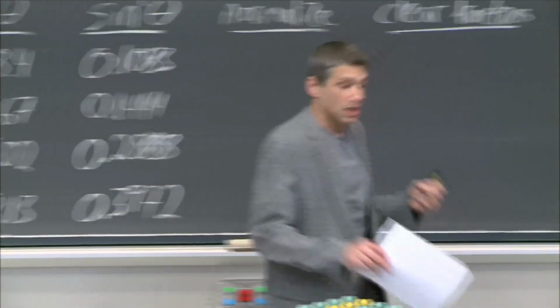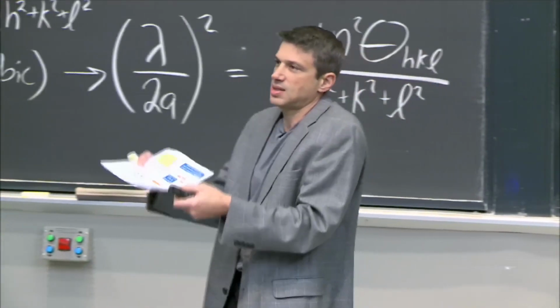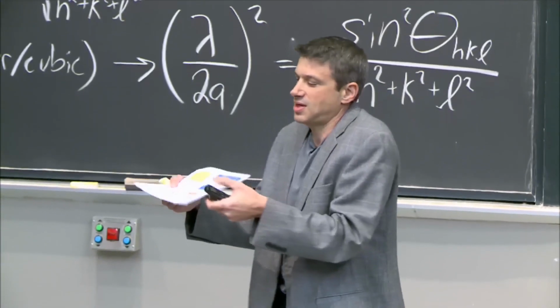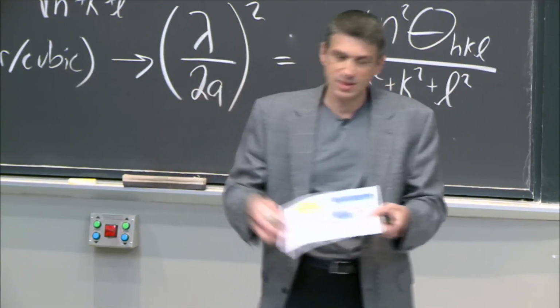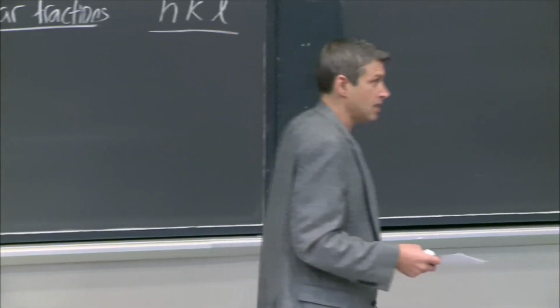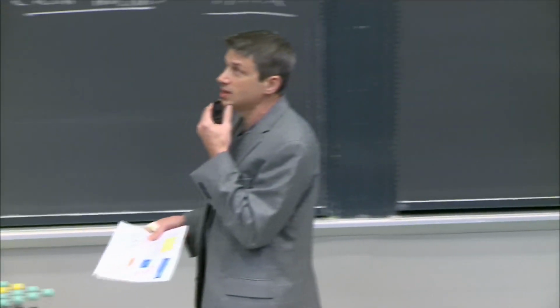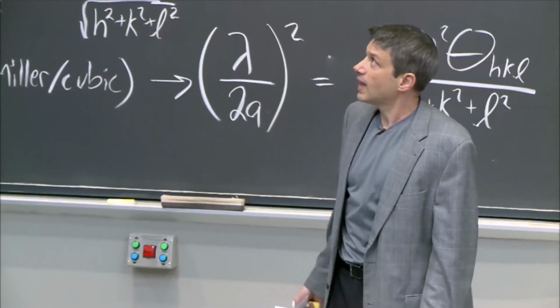All right. But so now it's easier, of course, you can understand. Some of these things have different ways of doing it, but you can understand, like changing the angle, it's going to be easier to move that sample, right? And then maybe the detector moves, but you might keep the source X-rays fixed. And what happens? Well, you do this and you generate a spectrum, right? So you're changing the angle, you're keeping this fixed, and you're saying, what do I got?